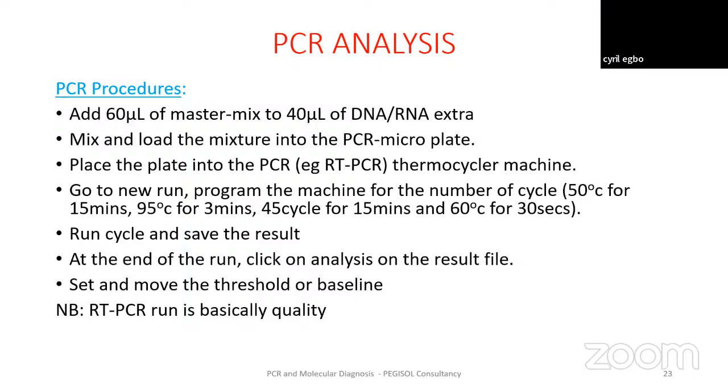I'm just putting this programming for you to know what is inside, what is happening in this process that the machine is undergoing. The program in that machine, for instance, if you are doing RNA analysis, this is the program you will see.